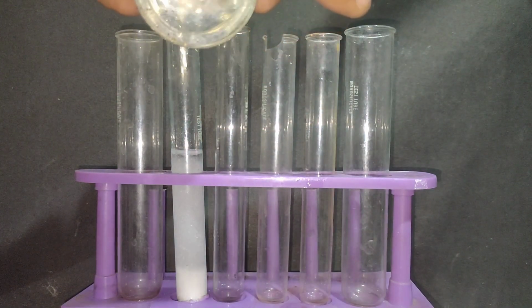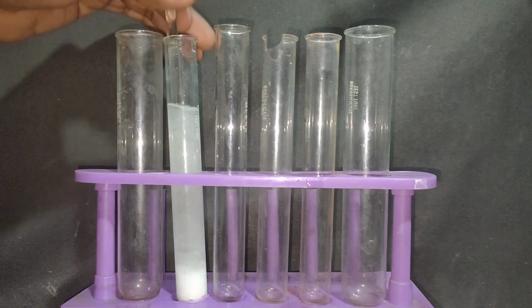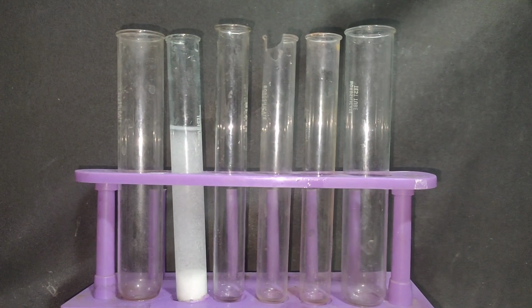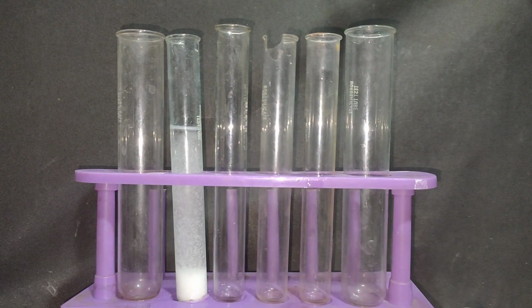Now, just by this test we cannot tell that lead is present. We can tell that group 1 is present. It can be silver, lead or mercury. Now how will we separate lead ions from silver? Lead chloride is soluble in hot water, whereas silver chloride and mercury chloride are not soluble in hot water.